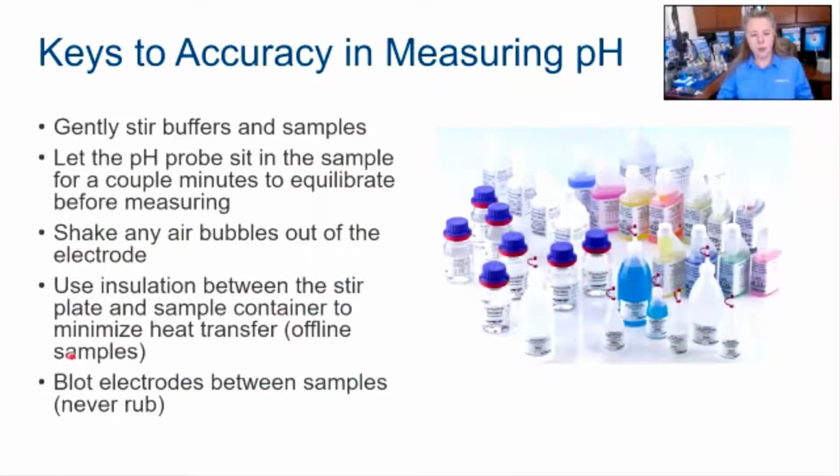Okay. I already talked about using insulation. And blot your electrodes between samples. Never rub that bulb. Storage. How do you store pH probes appropriately? Never, ever store probes in distilled water or in tap water. It's not a good thing to do, and it will shorten the lifetime of your probe dramatically, if not irrevocably.